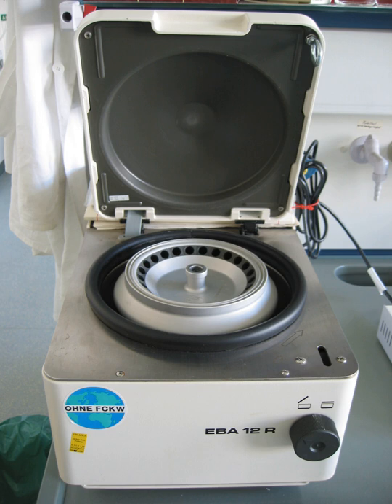Topic: Centrifuge tubes. Centrifuge tubes, also referred to as Eppendorf tubes, microfuge tubes, and microcentrifuge tubes, are precision-made, high-strength tubes of glass or plastic made to fit exactly in rotor cavities. They may vary in capacity from 50 milliliters down to much smaller capacities used in microcentrifuges, used extensively in molecular biology laboratories.